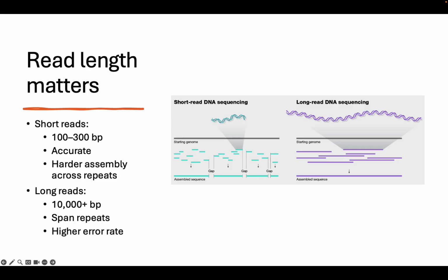Now, I found the most updated PacBio video I could, and the Nanopore one, the company itself hasn't put out a video in a while, so that's why I chose the Nanopore video narrated by that other gentleman. The accuracy is getting better every time. You saw PacBio has very, very high accuracy. My understanding of Nanopore is that it's still a little bit lower than short read, but at the end of the day, you also have those really long reads. So it depends on your application. It depends on your funding.